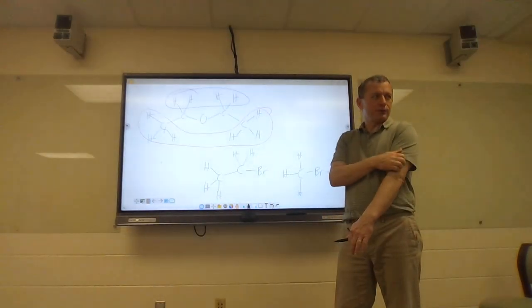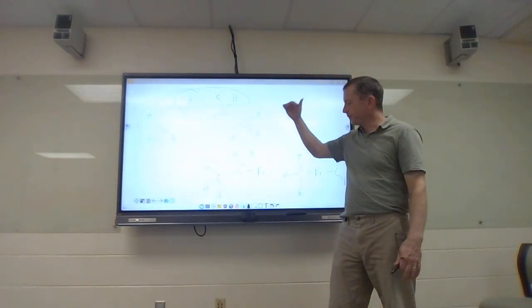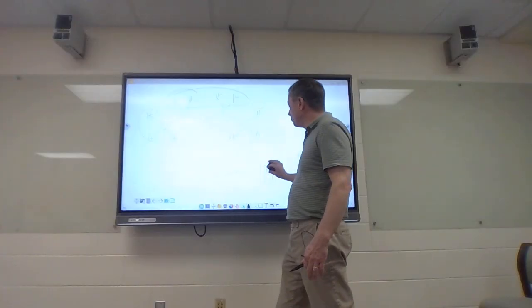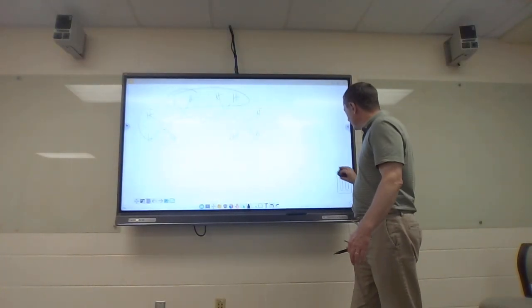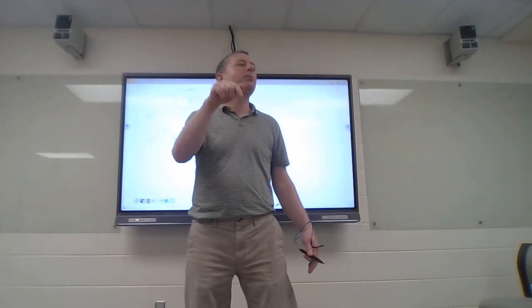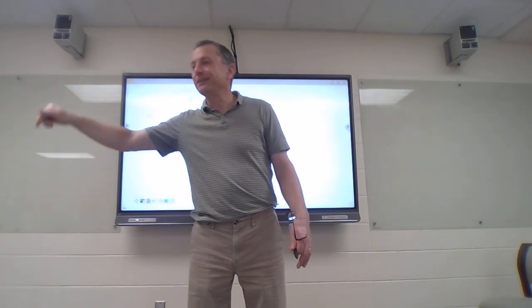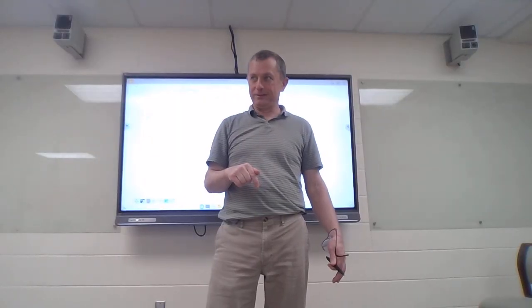All right? So with the integration, I wanted to give you that one little warning: be very careful of whether you have symmetry in your molecule. The way you'll know that your molecule has symmetry is if the number of protons added up from your integration is less than the number of hydrogens in your molecular formula. You catch that?